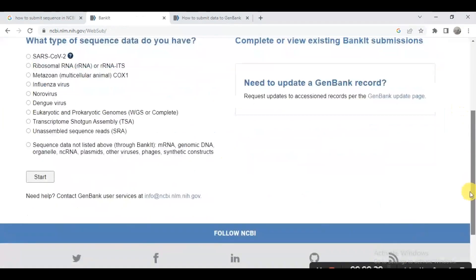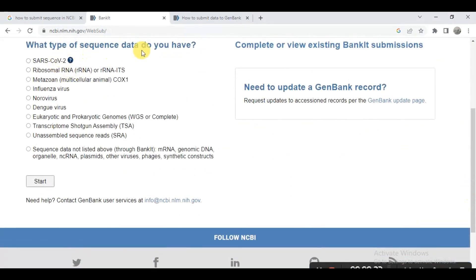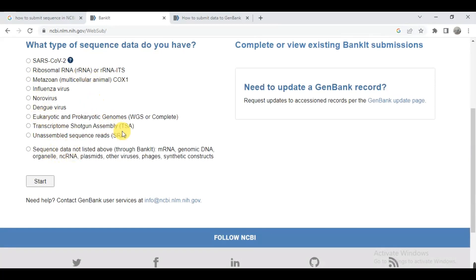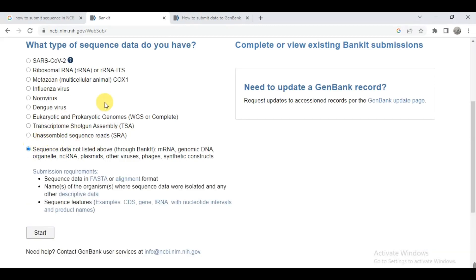Here you select what type of sequence data you have. My sequence data is from Glycine max and it is an mRNA or CDS sequence, so I click here. If you have a different type, you can click accordingly. My gene is from a crop organism and it is like genomic DNA or mRNA, so I click here and then click on Start.